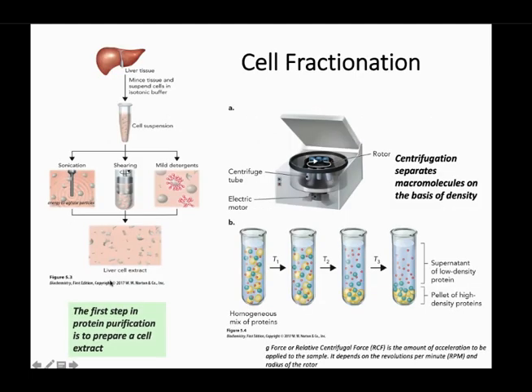It's very common, when you go to any lab, you will find a centrifuge. And this is a centrifuge right here. For example, if I'm looking in the liver for a certain enzyme or protein, how am I supposed to study the protein? Well, I have to lyse, literally break apart the liver, by any method, either sonication or detergents, so that you break apart all the cells, and then you will have the extract. But that's not it. That's one of the first steps. Then you have to collect that, and then you have to centrifuge at different forces, right?